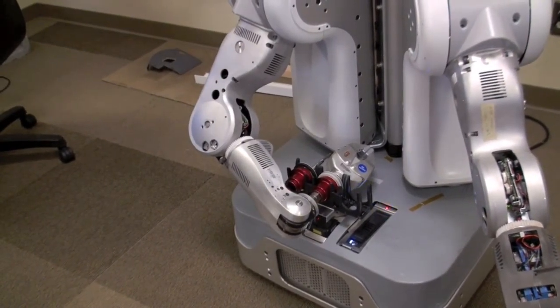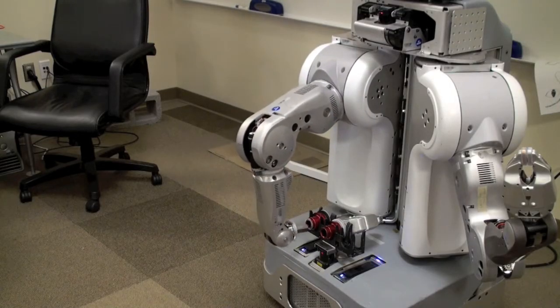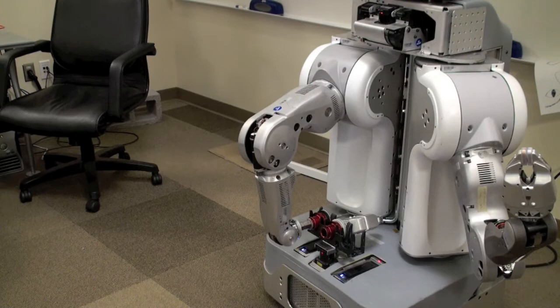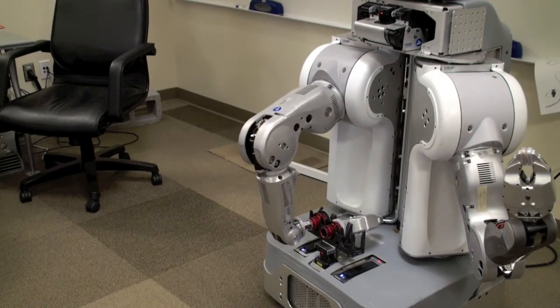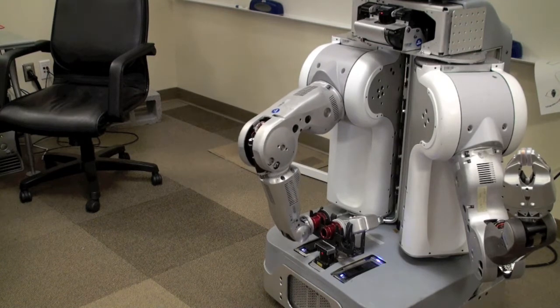The tricky part about attaching the second end effector is inserting that stub into the gripper. The way we did it was by actually just pre-recording the motions of the arms.